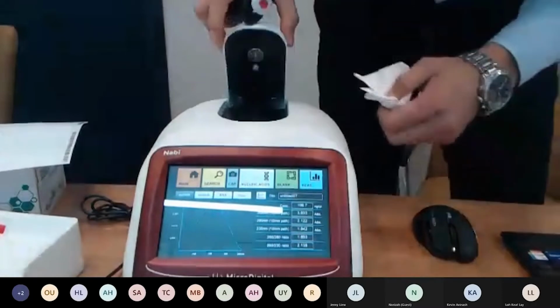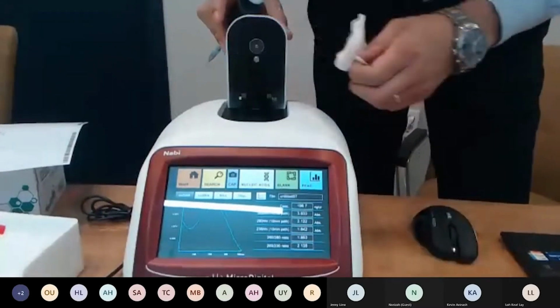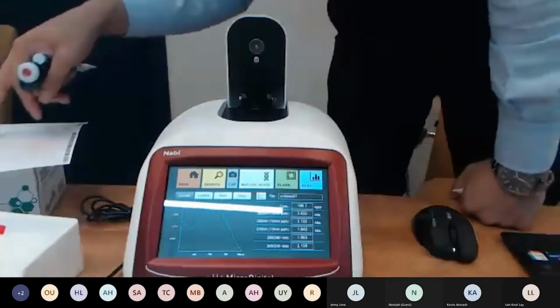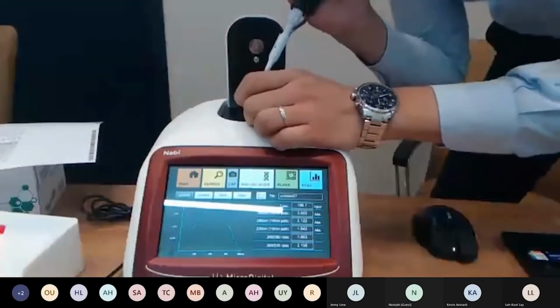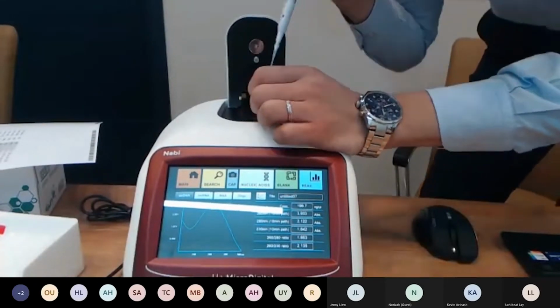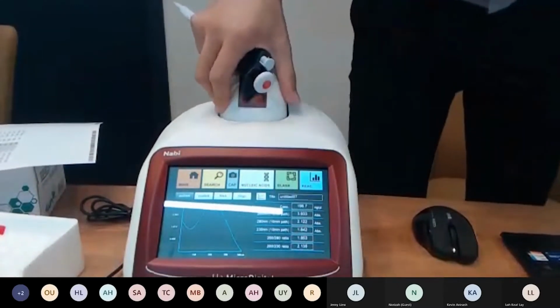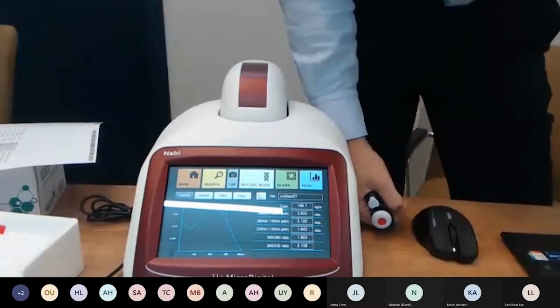And if you hear 2 distinct sounds when it should be 1, then that means you've done the pipetting wrong, like I did. So let's just move on from this sample. Let's go on to what should be 600, but what we measured is around 675 in the morning. The DNA samples, if you dilute it, let's say about 12 hours ago, and then you leave it out for a while, then it will go up because of the evaporation.